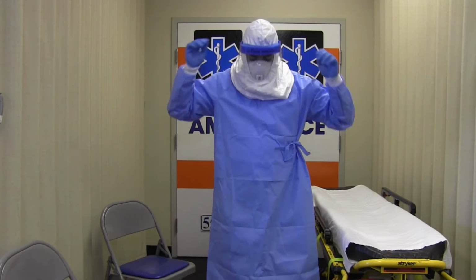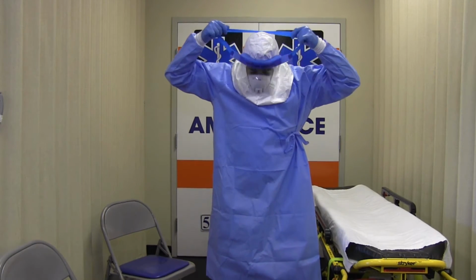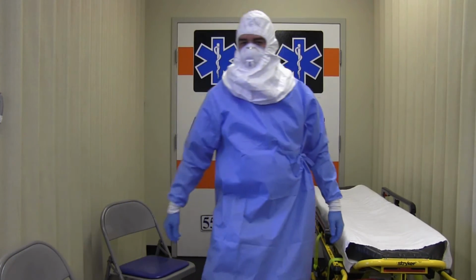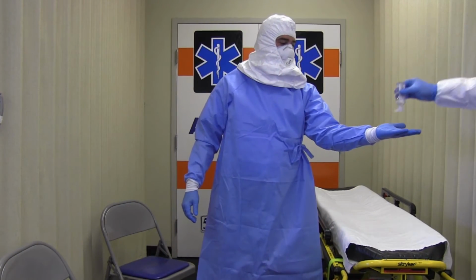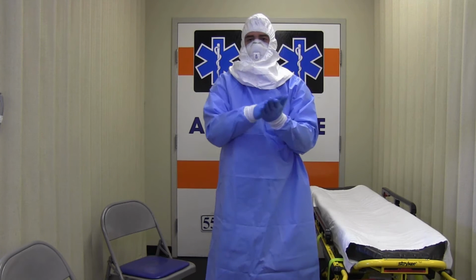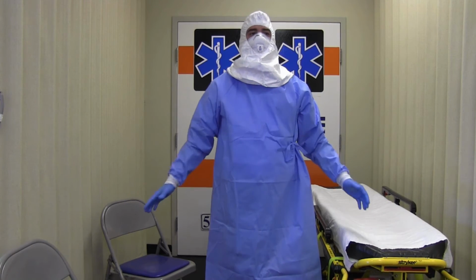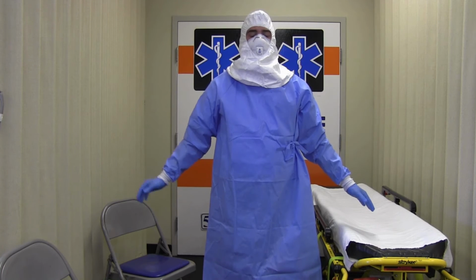Next, you'll remove your face shield. Remove the full face shield by tilting your head forward slightly, grabbing the rear strap, and pulling it over your head, gently allowing the face shield to fall forward and discard. Avoid touching the front surface of the face shield. You will again disinfect your inner gloves with an alcohol-based hand rub.